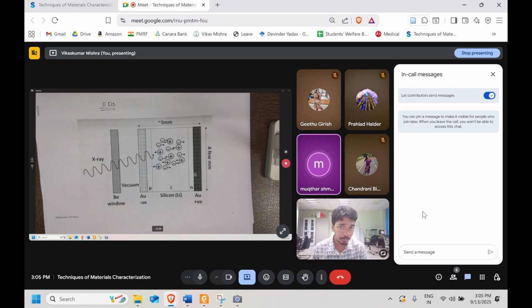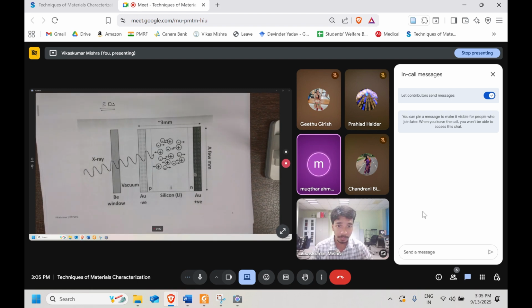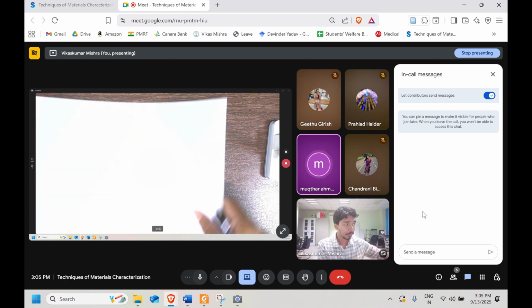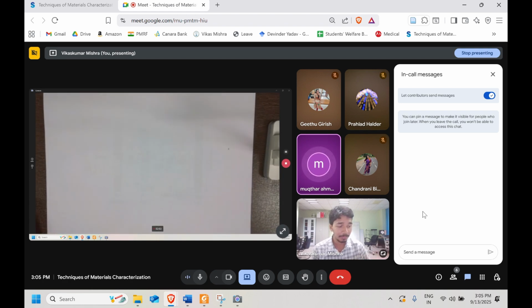Suddenly it is stated that backscattered electrons also contribute to topography. Many lecturers, and if you Google it, say secondary electrons are for topography and backscattered electrons for atomic composition, differing based on atomic number, while secondary electrons do not differ that much with atomic number. So this was unexpected for me from the last lecture.